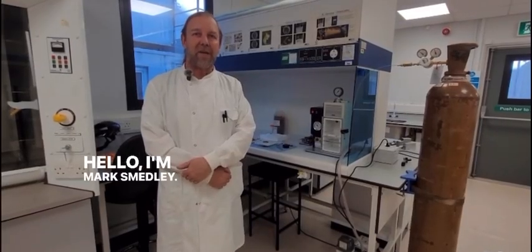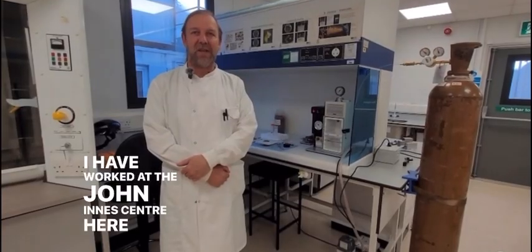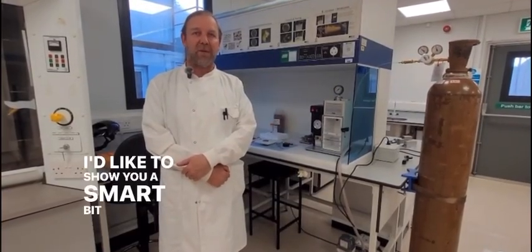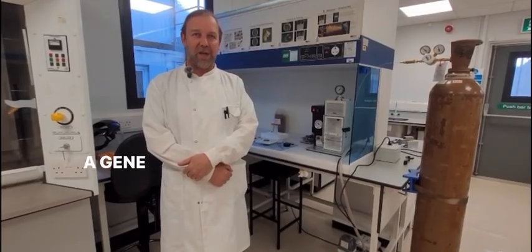Hello, I'm Mark Smedley. I've worked at the John Innes Center here for 25 years and I'd like to show you a smart bit of kit that we've got called a gene gun.